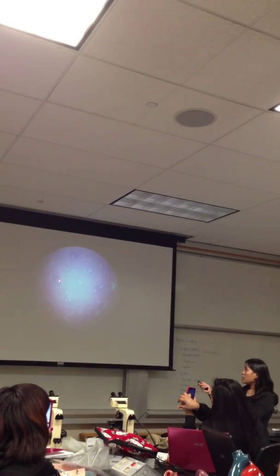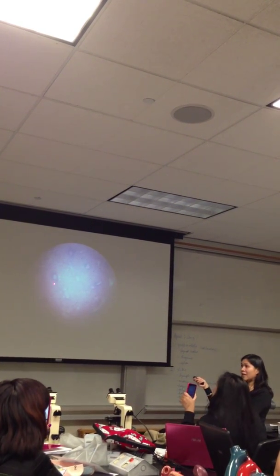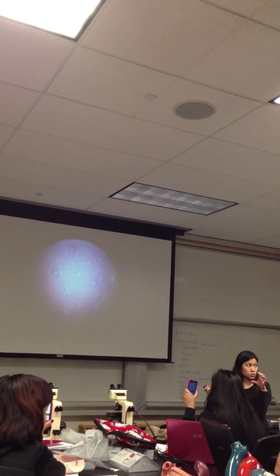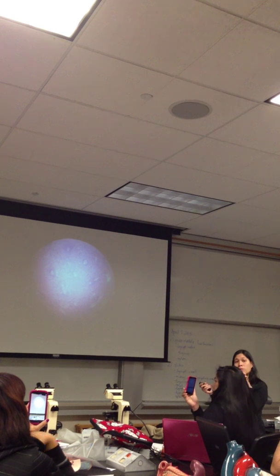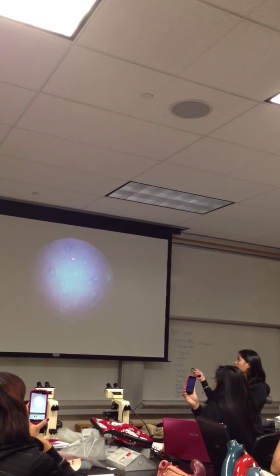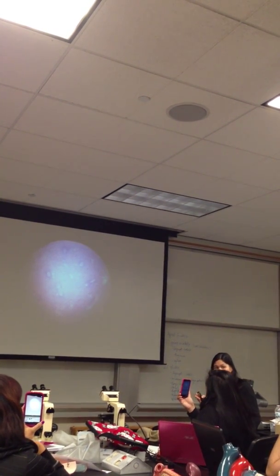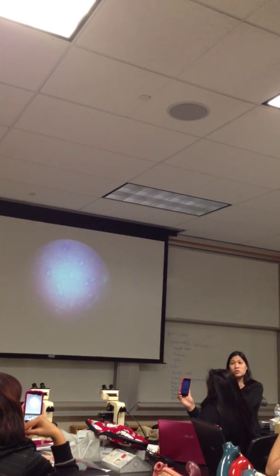These are the white pulps, a very lightly stained area in the middle. Those are nodules, and you'll find a group of lymphocytes there. On the red pulp, just think of the pinkish area, you're going to find blood material going through.